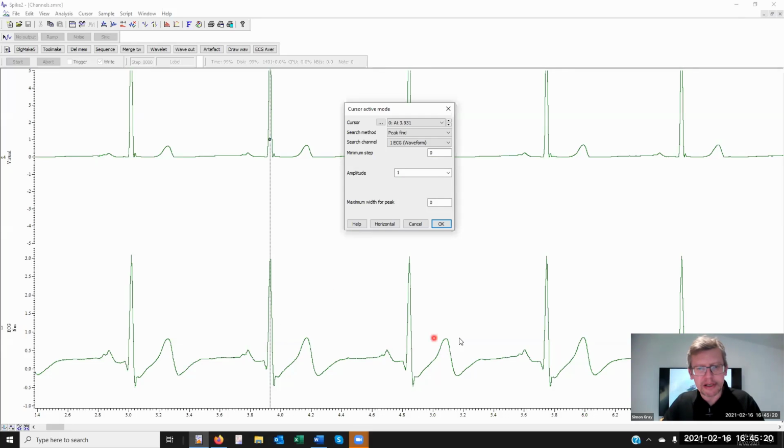Now, we don't know how this data is going to vary, so I'm rather worried about doing that. So therefore, I could change the minimum amplitude, perhaps to 2, and that means that this event here does not rise and fall by this value 2, so won't be included.